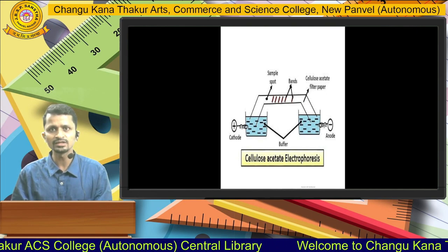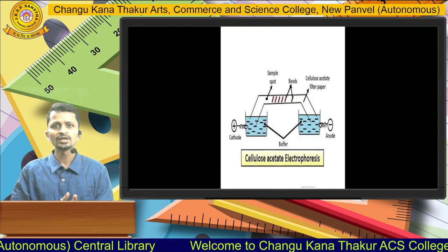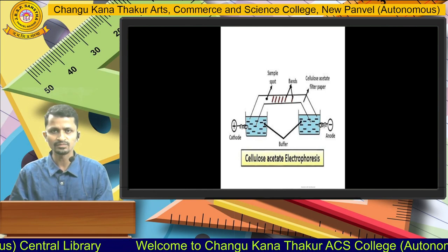So dear student, today we'll stop here. In this lecture we learned the two important types of electrophoresis technique, that is, the moving boundary electrophoresis technique and the zone electrophoresis technique.